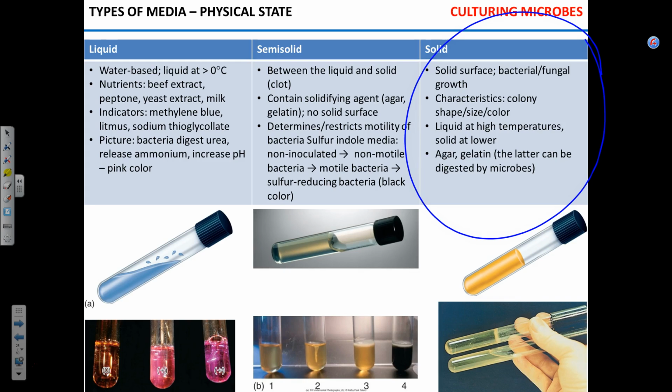Okay. Now, what are the advantages, disadvantages? Well, solid is fairly easy to handle. You can see the solid medium here. Nobody uses it like that. Really. No. Well, I can imagine in some cases, but it's not very common.